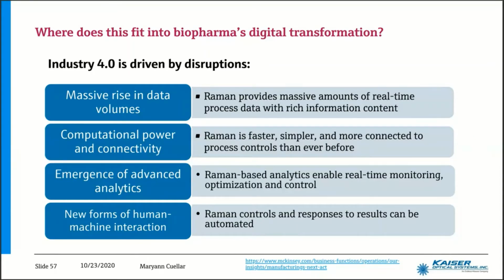If we look collectively across upstream and downstream and how Raman technology is contributing to biopharma, the overall trend is that it's driving PAT and digitalization initiatives due to the uniqueness of where and what it can measure in real time. Raman spectra collected continuously from a bioprocess are often transformed into simple univariate outputs like a glucose concentration in upstream or mAb concentration in downstream.